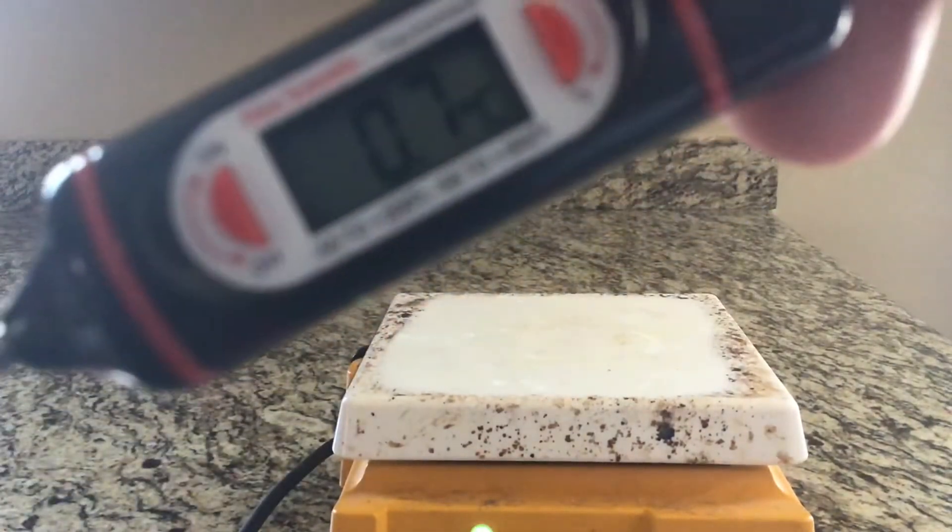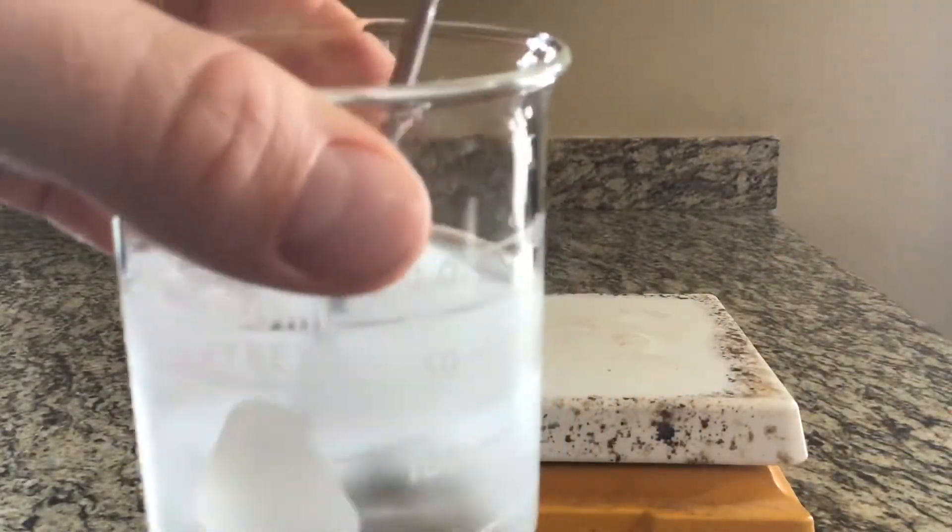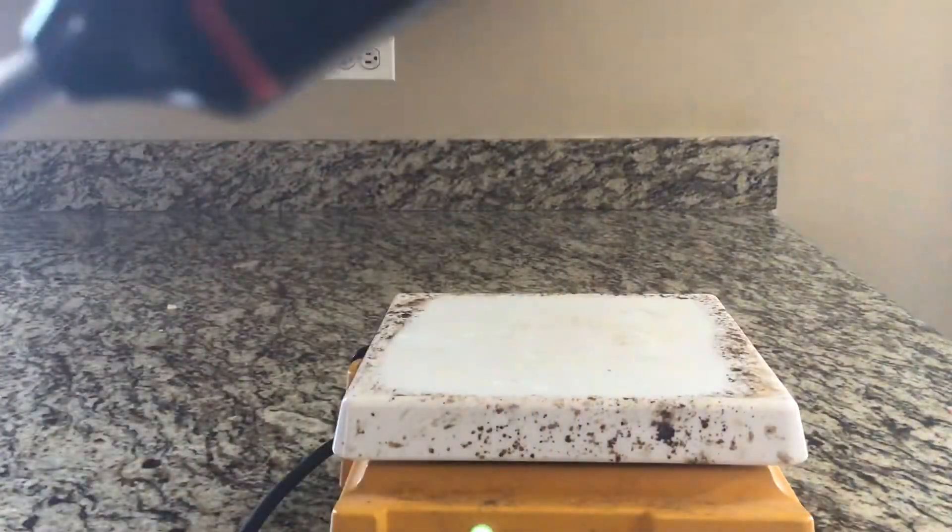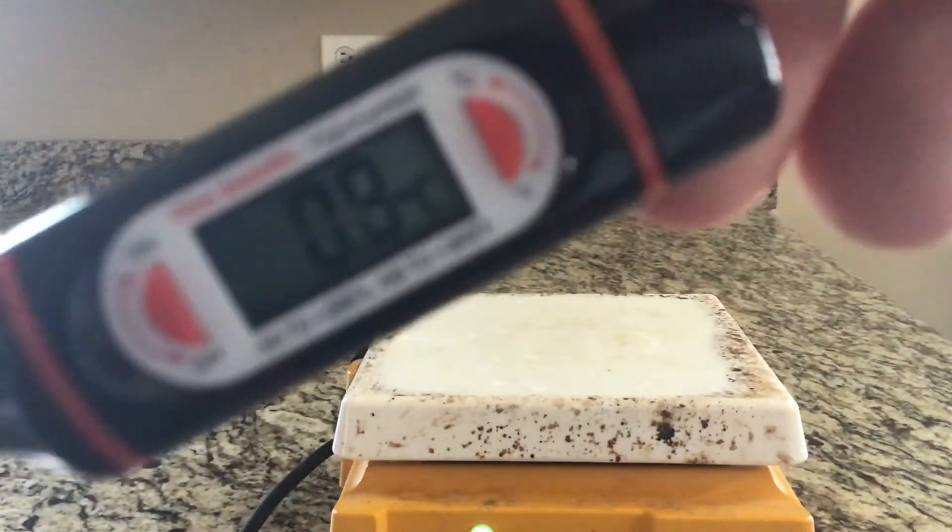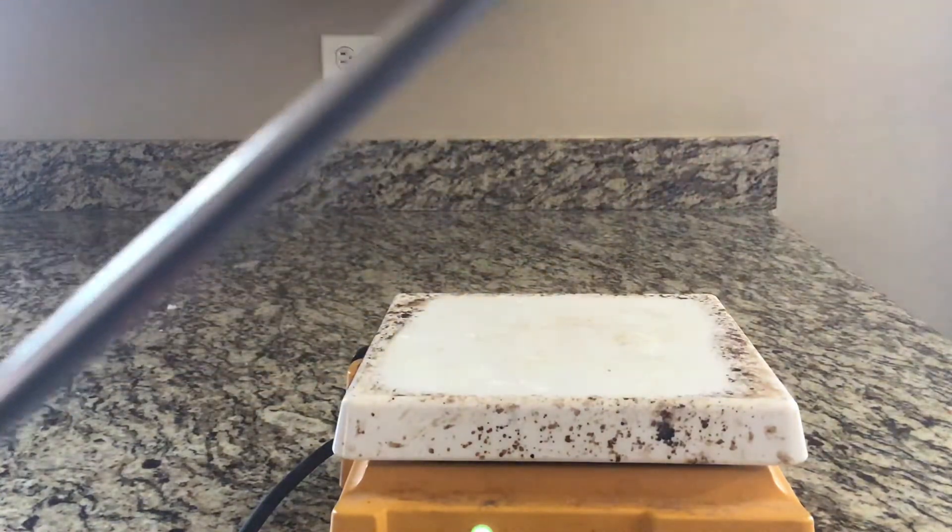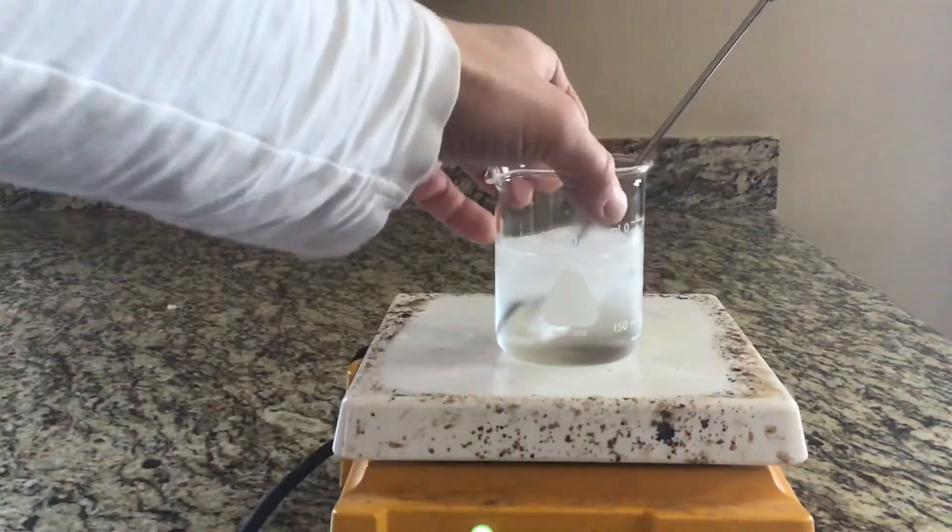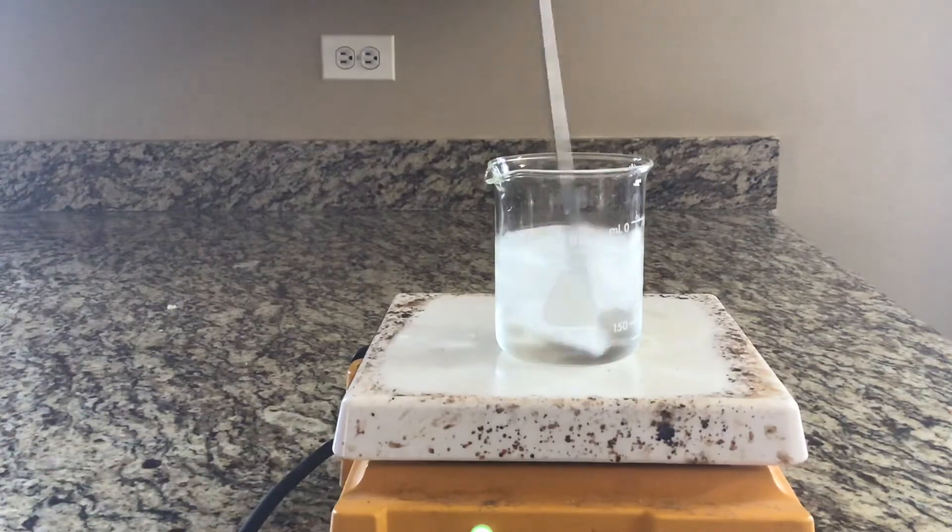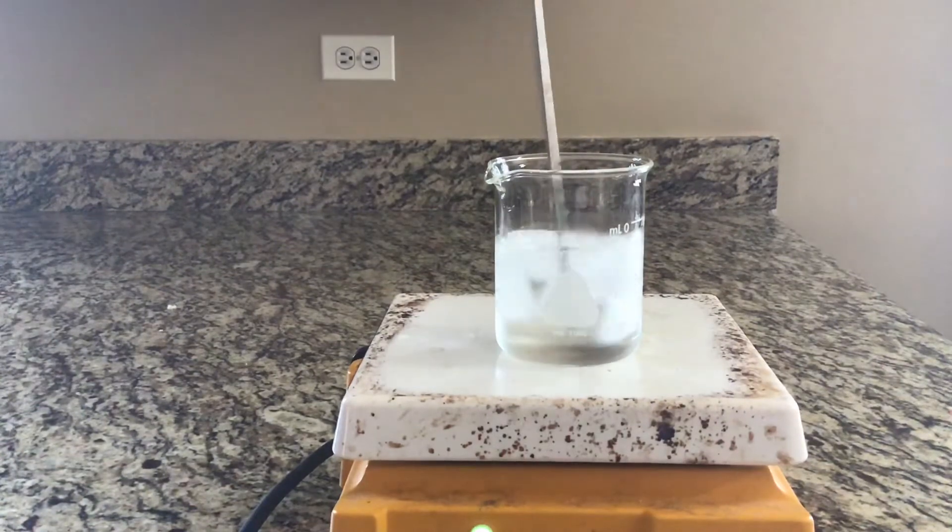Let's get our initial reading. This has been in the ice water now for a good minute or two and there's still ice and water in there. We're going to say that our starting temperature is about 0.8 degrees Celsius. I'm going to put it on here, start stirring this and heating it up, and we're going to take the temp every 20 seconds.